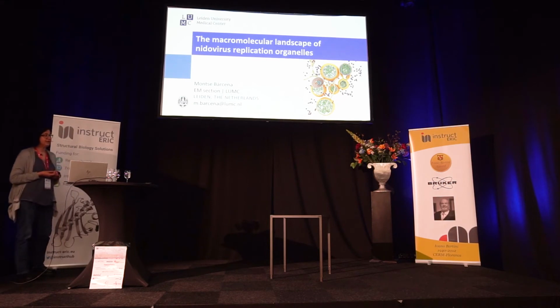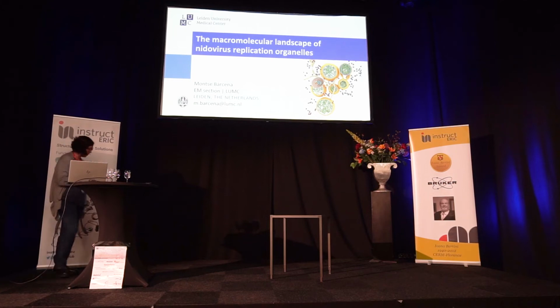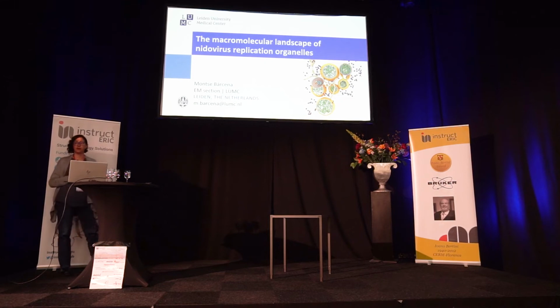And we in Leiden have been studying these replication organelles for many years using classic EM approaches, conventional samples, so more from the cell ultrastructural side, and more recently with cellular cryotomography.